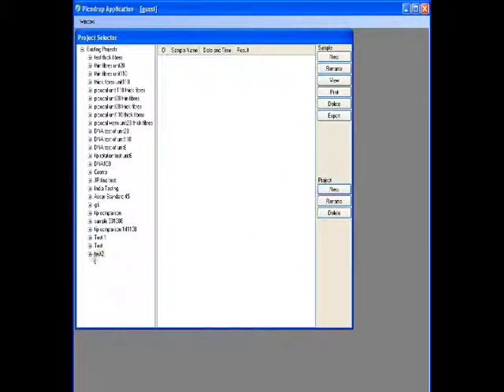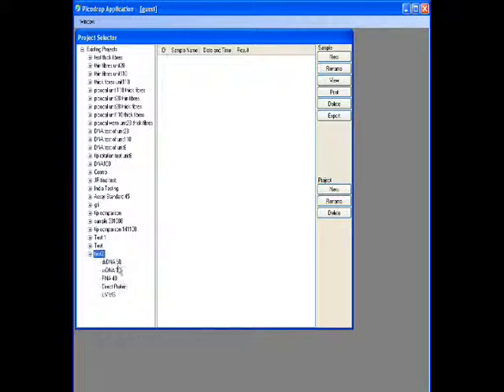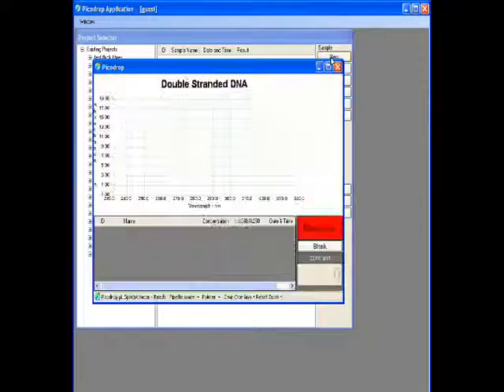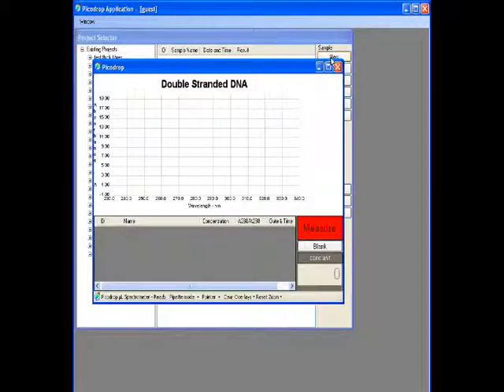Click on the plus symbol and a choice of various different assays is presented. Choose the assay of interest and then choose New sample. This will present the graph screen.